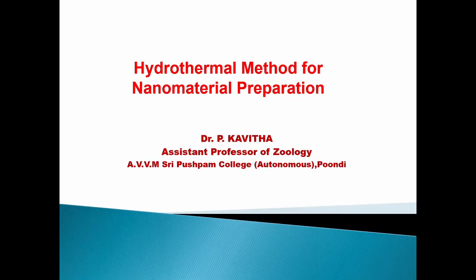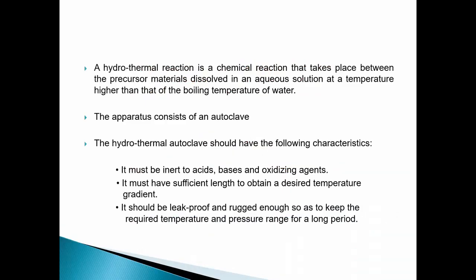Hi everyone, in this video I am going to talk about hydrothermal method for nanomaterial preparation. A hydrothermal reaction is a chemical reaction that takes place between the precursor materials dissolved in an aqueous solution at a temperature higher than that of the boiling temperature of water. The apparatus consists of an autoclave.